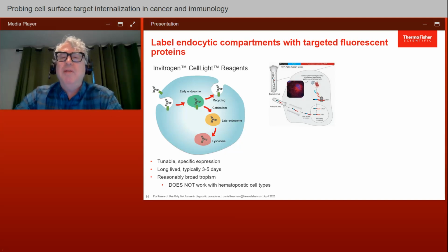And so we do that with an interesting construct here. And this is a modified form of the baculovirus that we call BACMAM. It transduces mammalian cells by virtue of pseudotyping on the particle surface. And then it carries our payload, which is astounding, actually, can carry up to 30 kb.